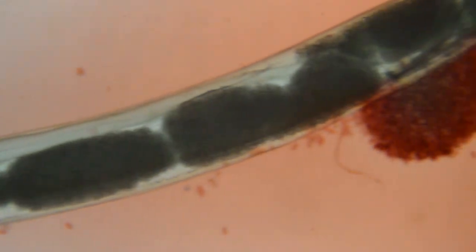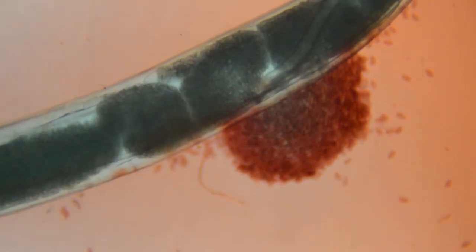Let's go back to the middle where we can see the eggs are being released in this mass. Let's zoom in and get a closer look. The eggs are released out of an opening on the side of the body. As you can see, the eggs are moving back and forth and some move out.